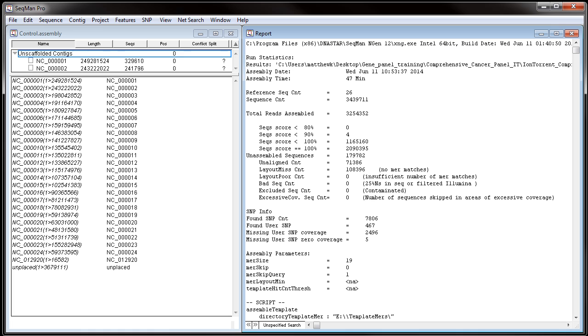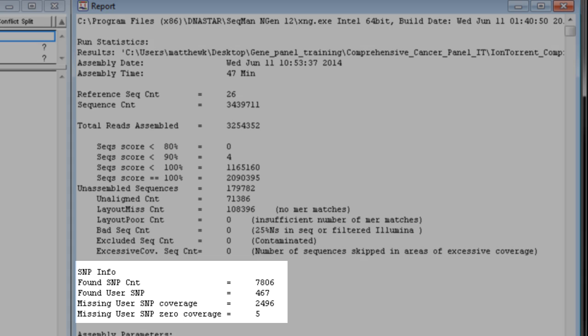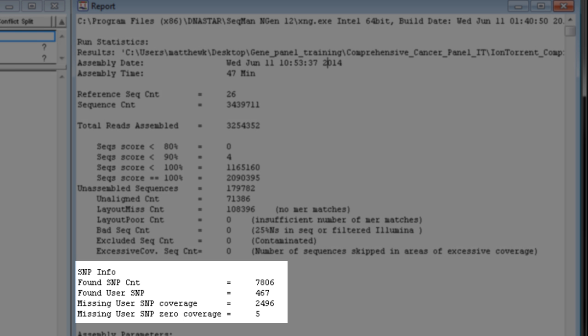Once your assembly is complete, open it in SeekMan Pro. Here, the project report shows some summary information about the SNPs in the assembly. The found SNP count represents all of the SNPs found in the assembly.